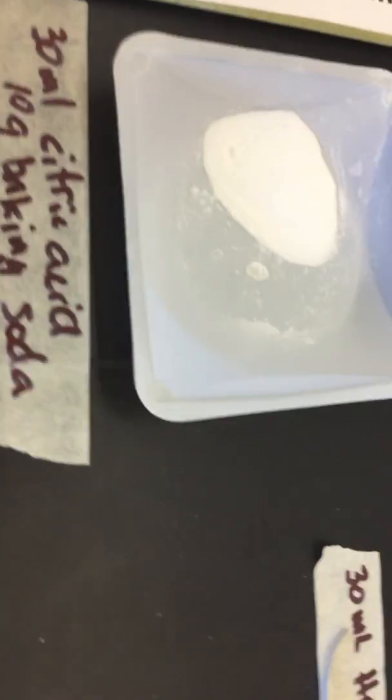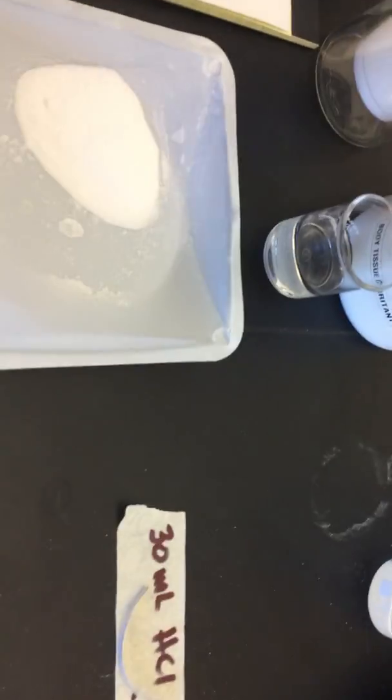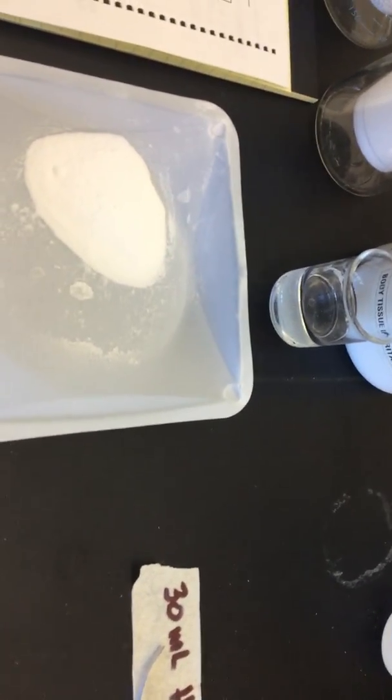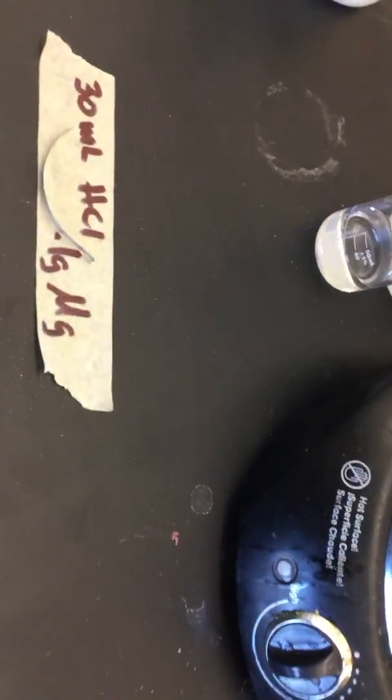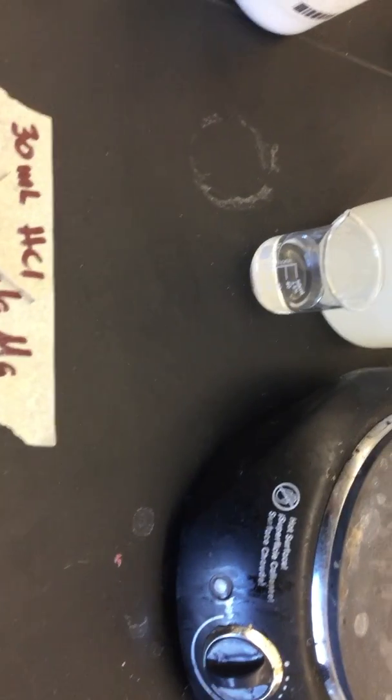We have some baking soda. Here's some baking soda right here. And I also have 30 milliliters of citric acid. And we're going to be taking a look at what's going to be happening to the temperature during the duration of that experiment. The second experiment is going to be taking a look at hydrochloric acid, and it's also going to be taking a look at magnesium metal. So we're going to take a look at the temperature change in that reaction as well.